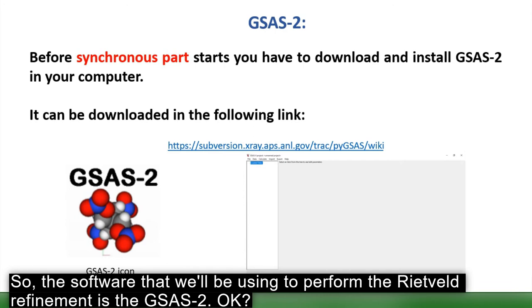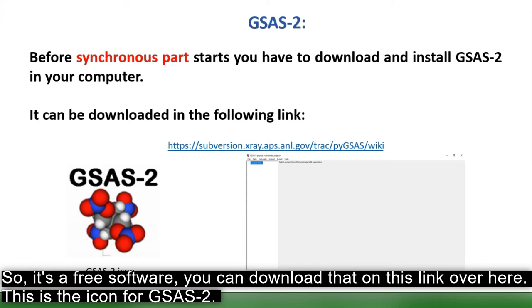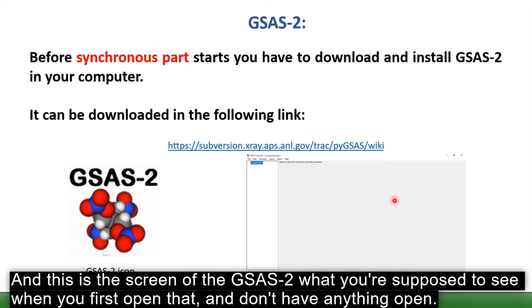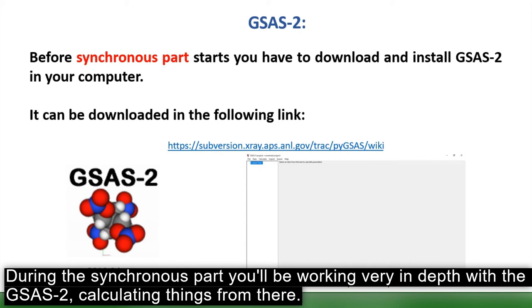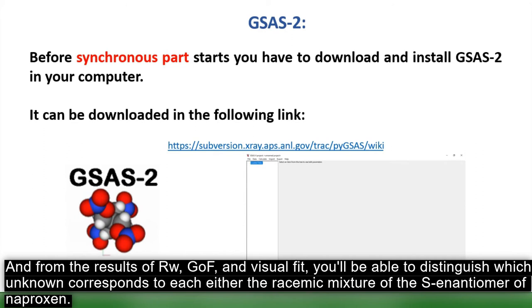The software used to perform the Rietveld refinement is GSAS-2, a free software available at the link shown here. This is the GSAS-2 icon, and this is the opening screen. During the synchronous session, we will work in depth with GSAS-2, and from the Rwp, goodness of fit, and visual fit results, we will identify which unknown corresponds to the racemic mixture or the S-enantiomer of naproxen.